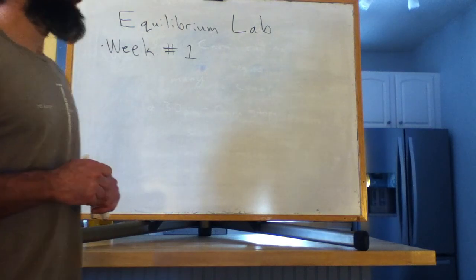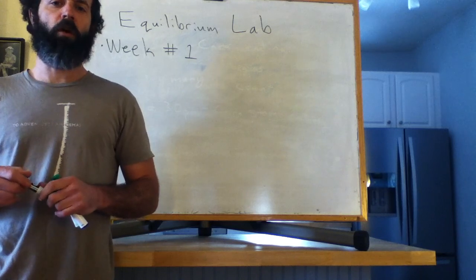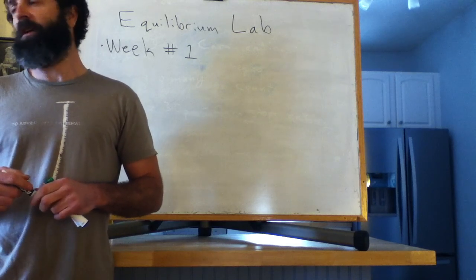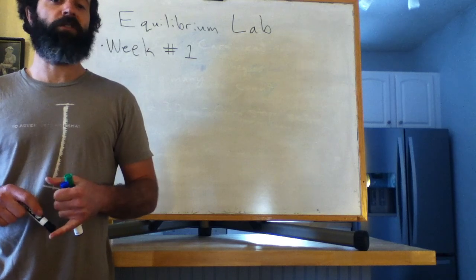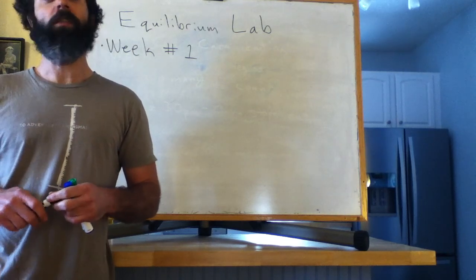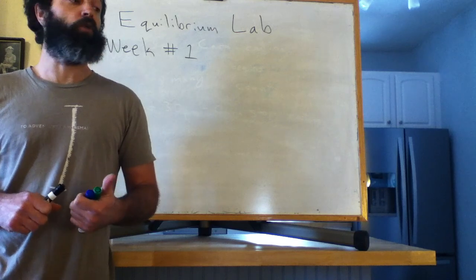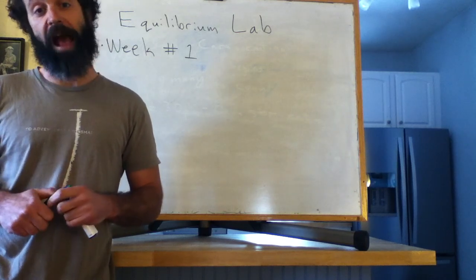So let's talk a little bit about this equilibrium lab. I have posted a video that Scott kindly made, walking through the experimental setup. You have already done essentially all of this. All the techniques we use in this lab, we used in the kinetics lab that you just completed. That involves making standards, making solutions of accurately known concentrations using volumetric glassware, so volumetric pipettes and volumetric flasks.